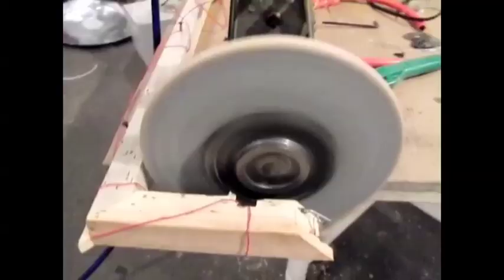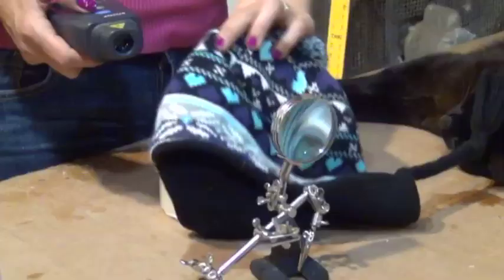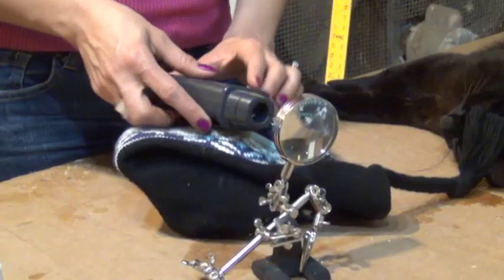We have used this device in previous videos to measure the RPM of our steam and Stirling engines. By simply placing the laser on something and shining it through the magnifying glass, our laser microscope is ready for action.